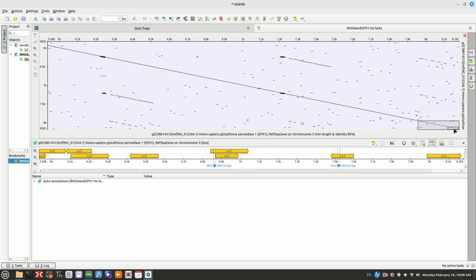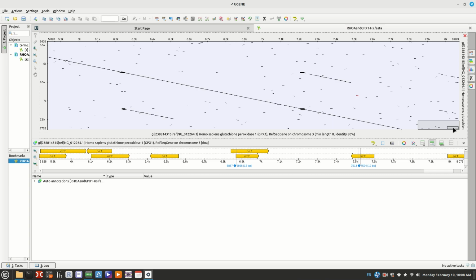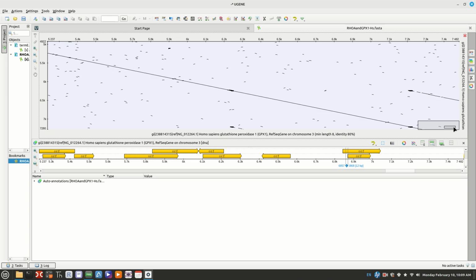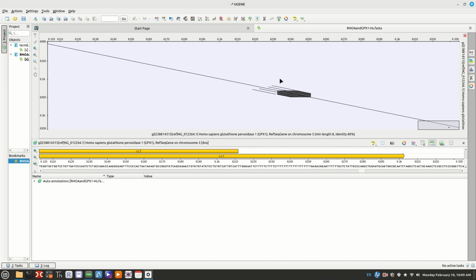I want to go down here, of course, at the end. All right, and right here, maybe a little bit further away. So 6,000, I want to get 6,000 in the middle. There we go. So you might have to click. It looks like if you want to do this, the one with the hourglass here is the one you click to get the box centered. Okay, so now we can home in on our 6,000 sequence that we're looking at, and we can begin changing.